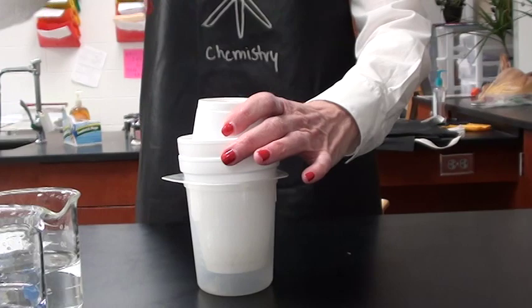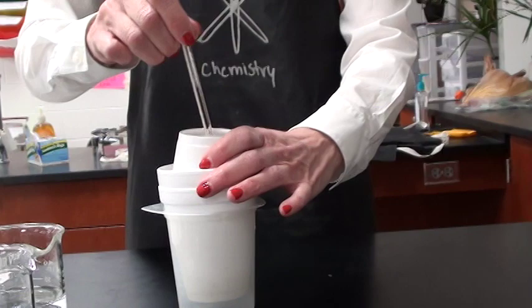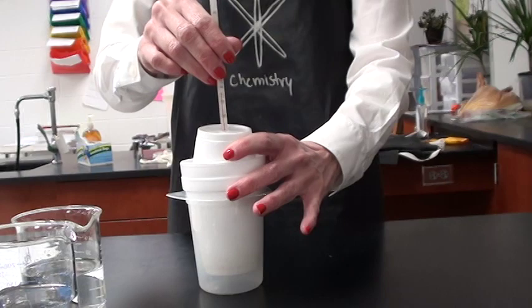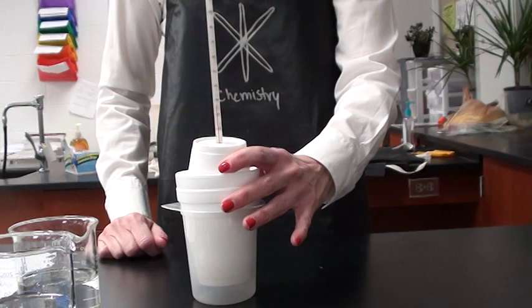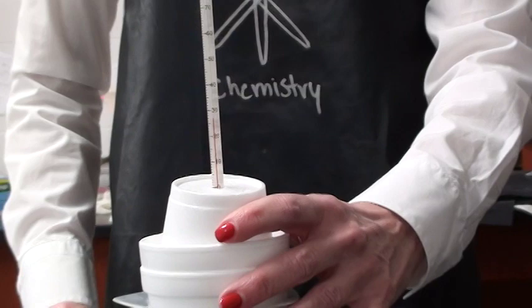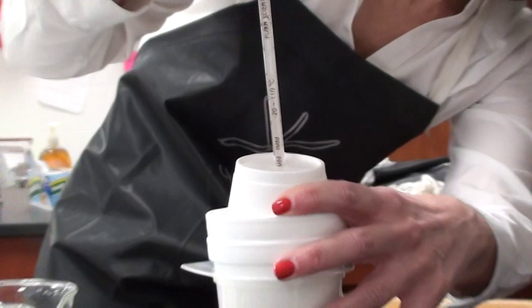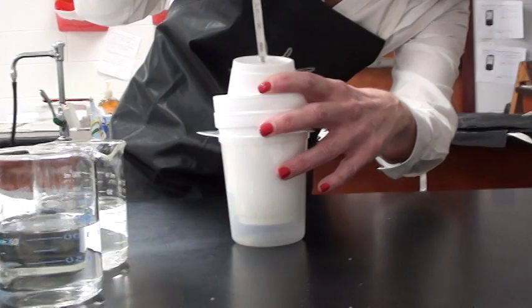Put the thermometer in and stir it around and wait for the highest temperature. It's 27.6 and that will be my final temperature.